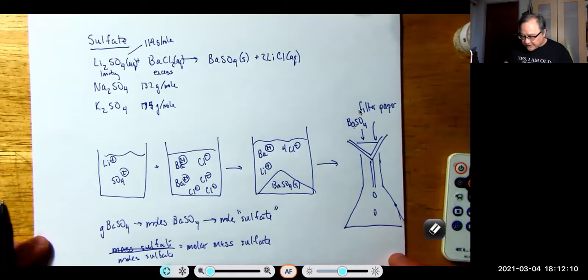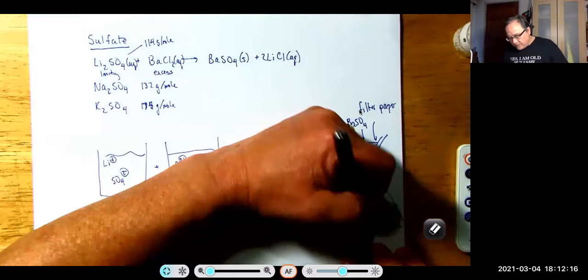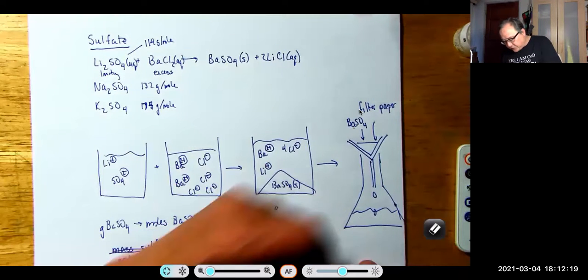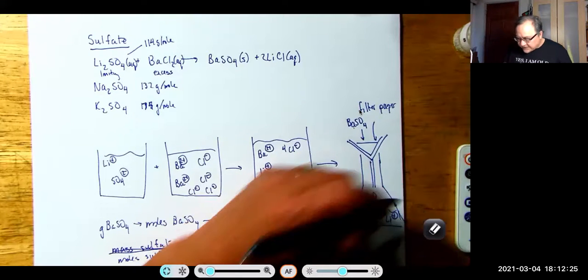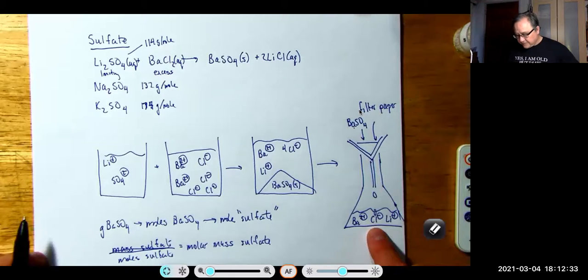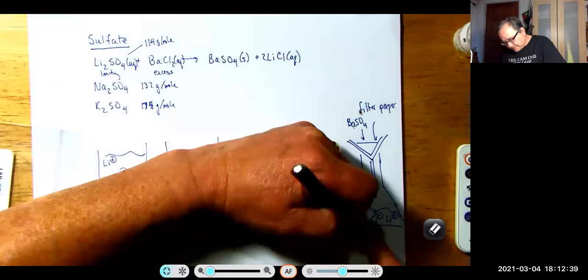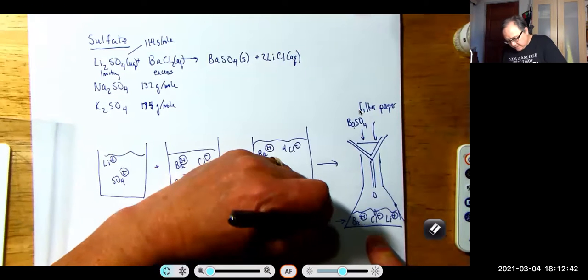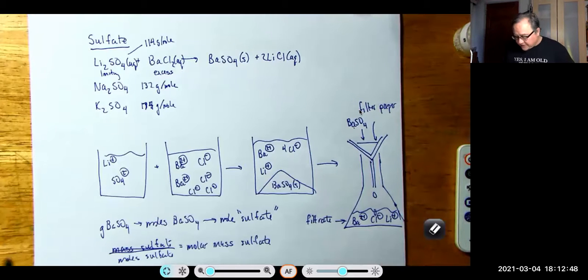Okay, so we need to rinse these ions out. And there is a clever way to do it. These ions should make it through the solution. And it turns out that if there's one of these ions there, they're all there. So there's a really nice little experiment you can do with the chloride ion to see if it's in your filtrate. This is called filtrate, the liquid that comes through. You add silver nitrate to it, because if there's any chloride, it'll turn cloudy right away.